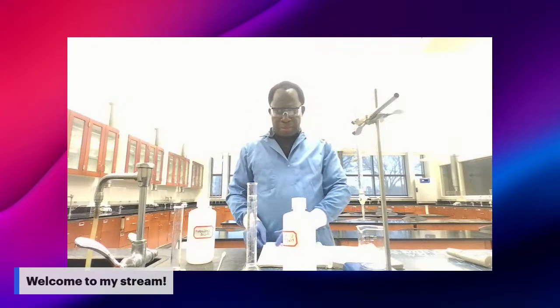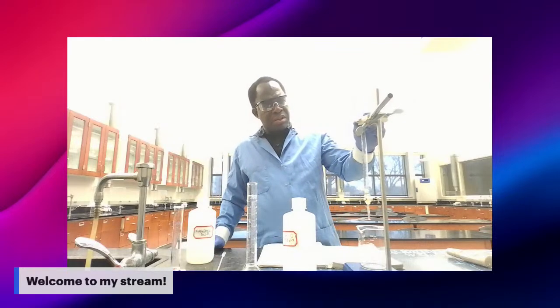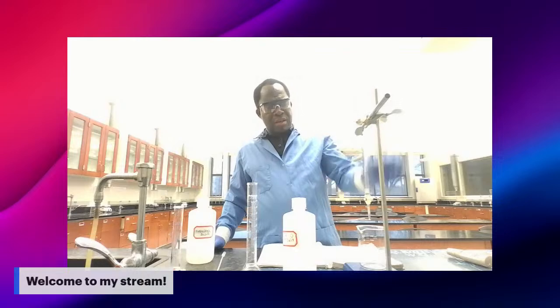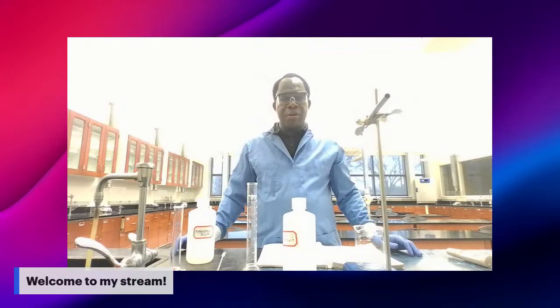Now, to start your lab, look at the setup I have in front of me. You need to make sure you have the same setup on your desk.